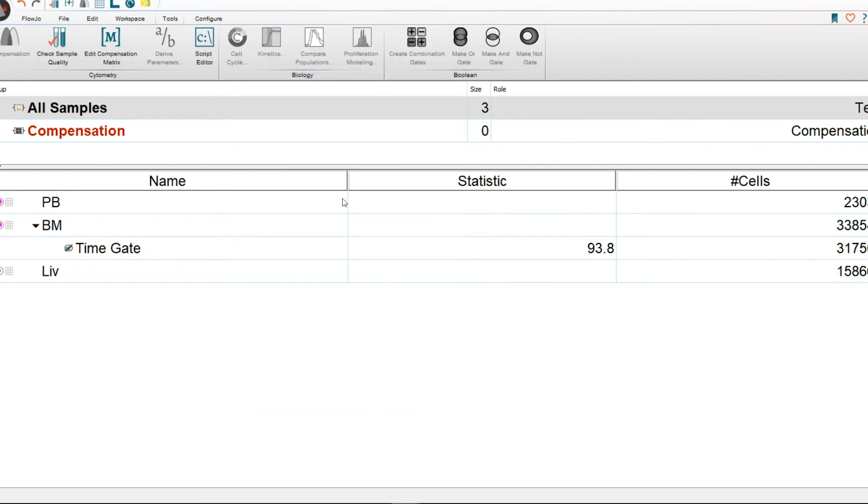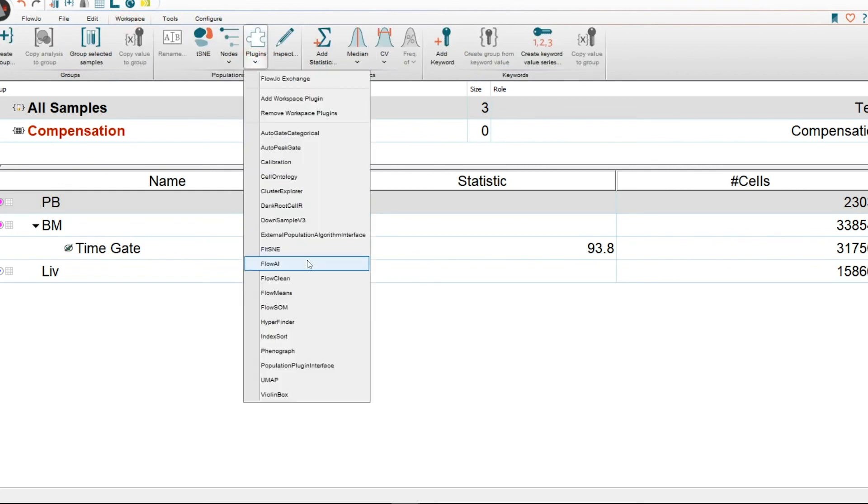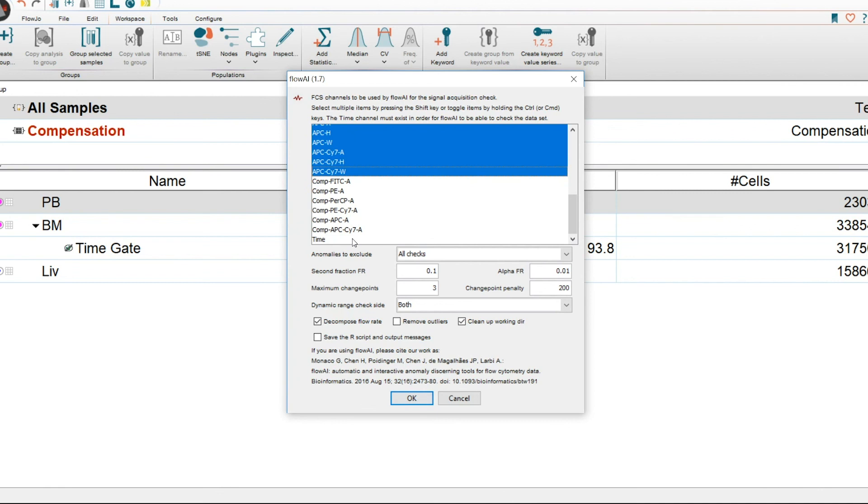Now, what about if you wanted to use some of the plugins, which is a lot faster and it's going to be far more accurate. So you click on the sample of interest, you click on workspace, click on plugins, then click on FlowAI. Select all the non-compensated parameters, like so, as well as time.